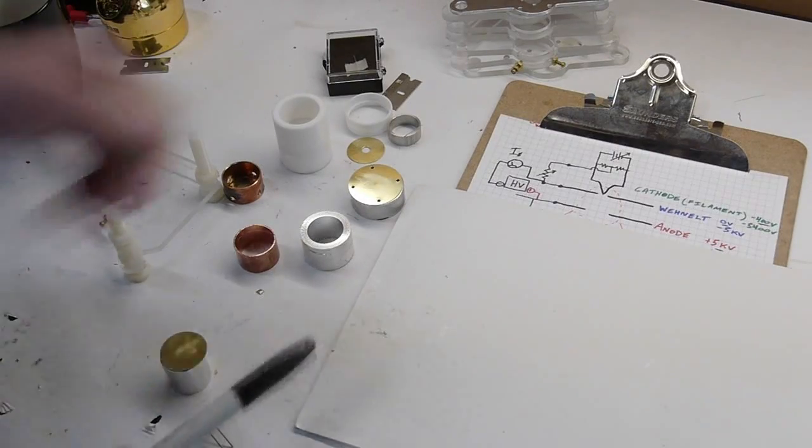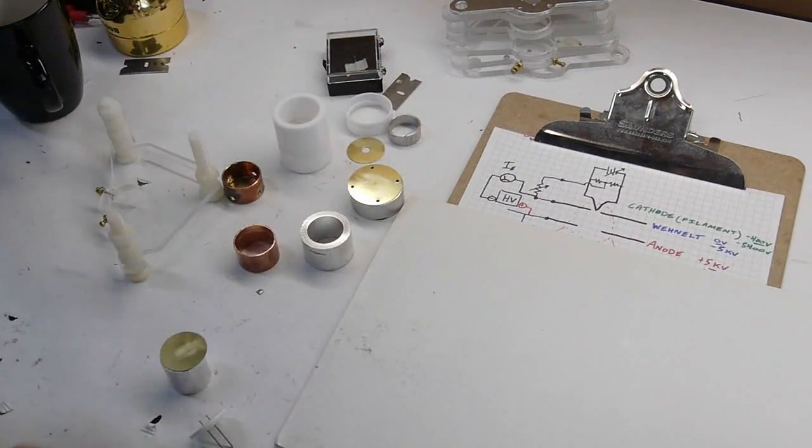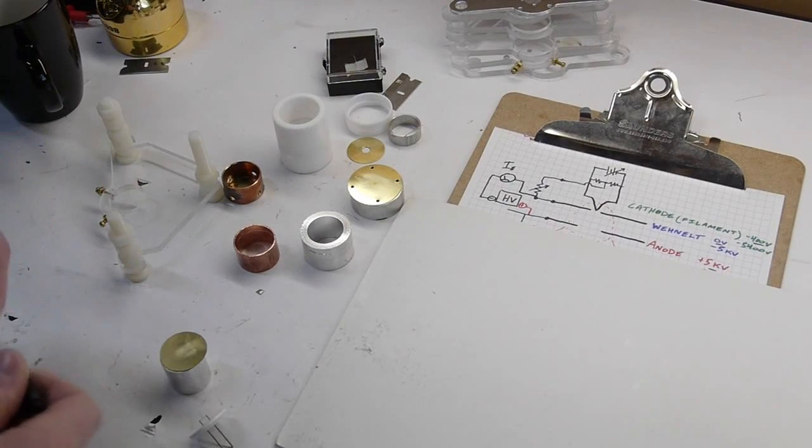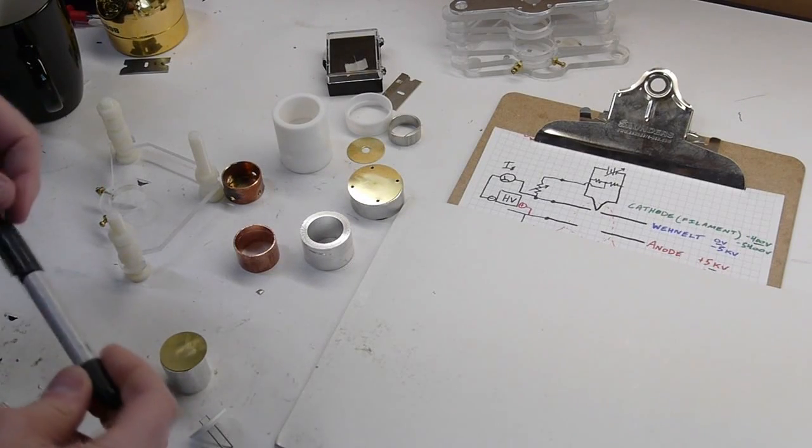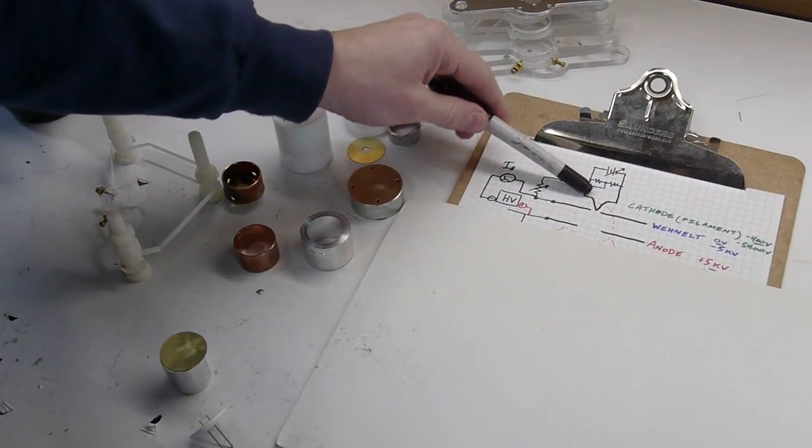So here is a schematic of the electron gun in the electron microscope and I will run through the parts of it and how it's built first and then talk about operation. So at the top, this curved piece represents the filament, also called the cathode. In this case they're the same.